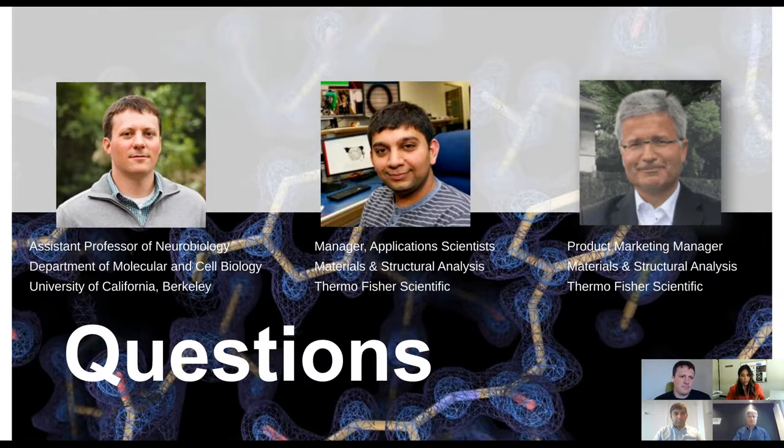Okay, and I think this is maybe a specific question for your task two project, Steve. Have you tried modulating different lipids for the nanodisc, such as lipids unique to the brain or other organs? Yeah, that's a great question. We have not yet. We'd be very interested in doing that, especially with the higher resolution structures now where we can really make out what some of these interactions look like.